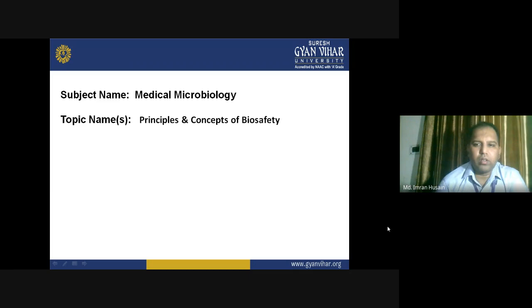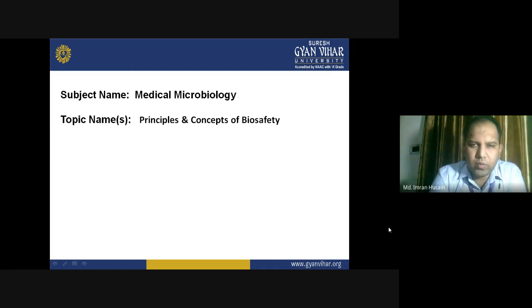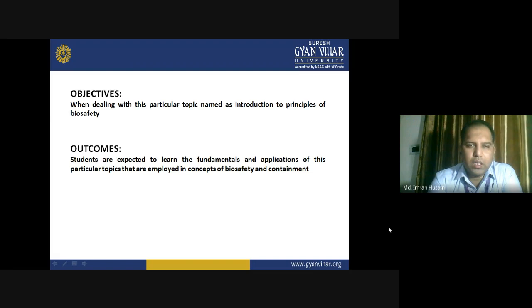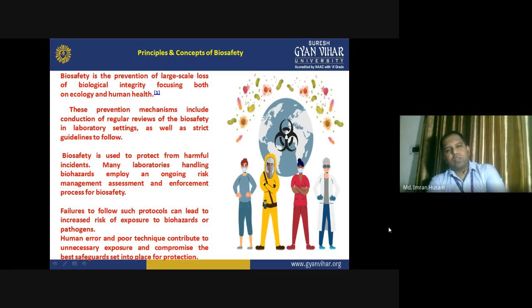Hello everyone. Today in the subject of medical microbiology, we are going to study the principles and concepts that are involved in biosafety. The outcome of this lecture is that you should understand, as a student of medical microbiology, what are the principles included in biosafety. We are expected to learn the fundamental applications of biosafety that are employed in laboratory operations. Coming on to the principles and concepts of biosafety.